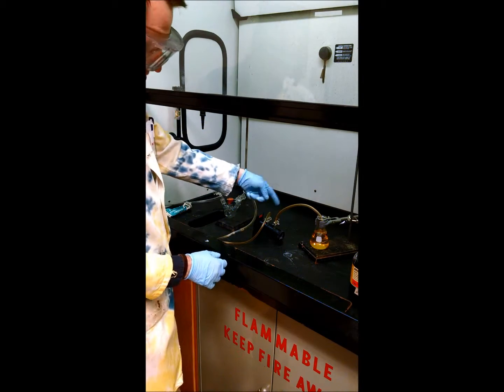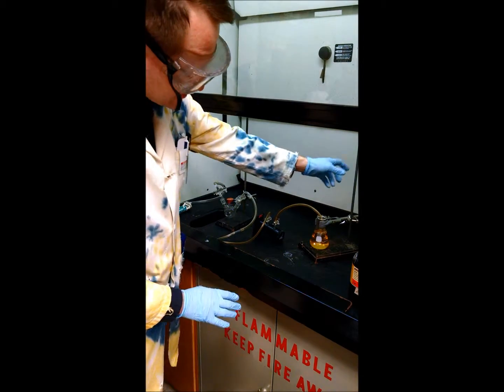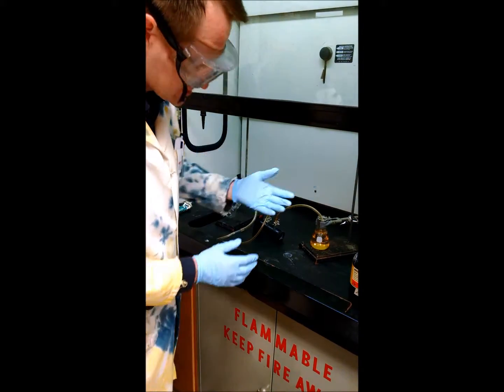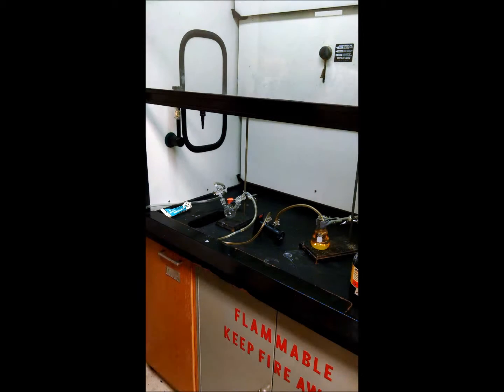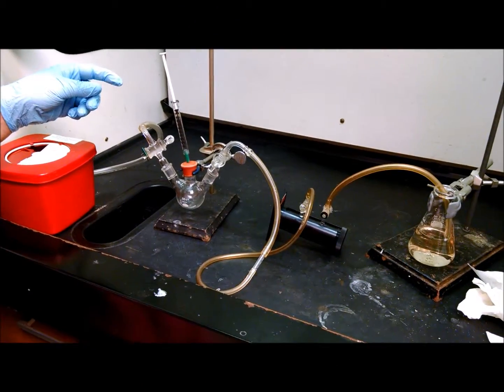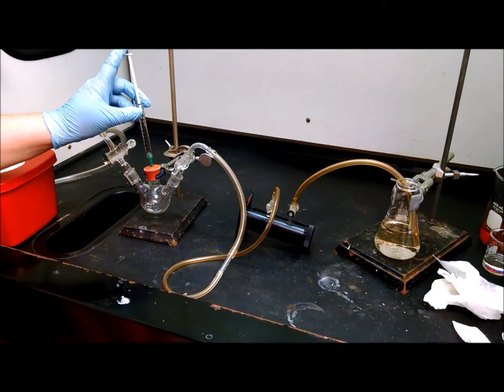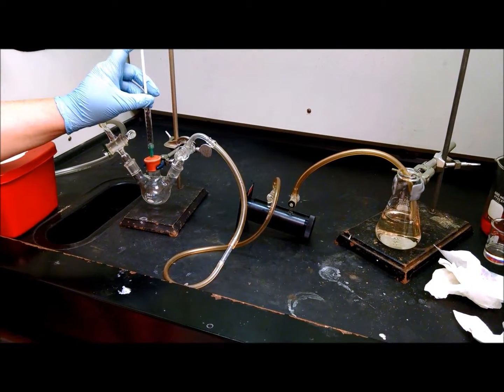So now with all the valves open, we're going to turn on the nitrogen gas — it should flow through here and bubble through our indicator solution. And we're ready to start the reaction and generate the hydrochloric acid. We have one milliliter of thionyl chloride at the bottom of the flask, and now we're going to add one milliliter of water to that, drop-wise.